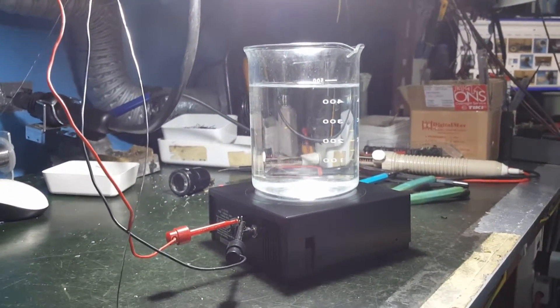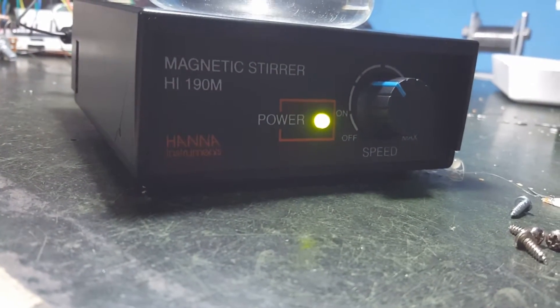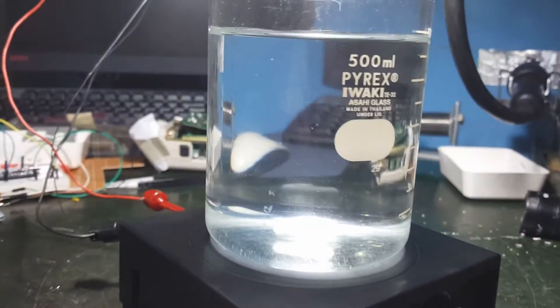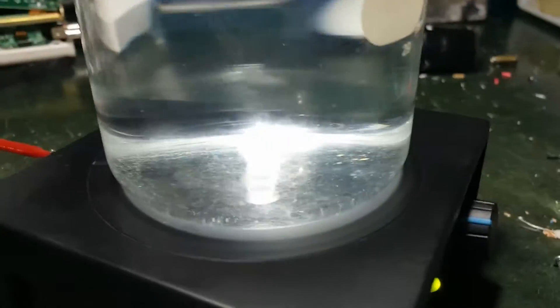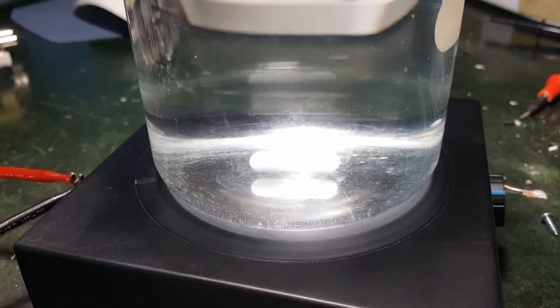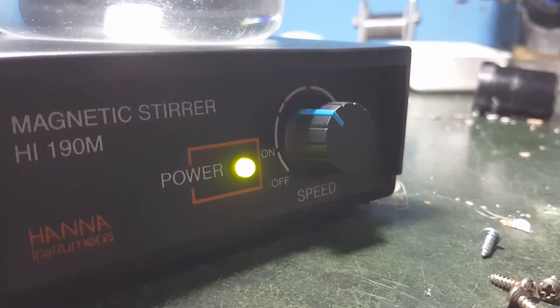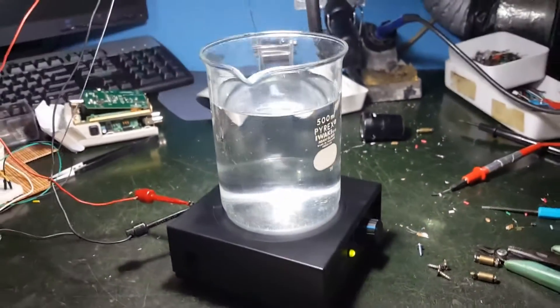It is already working as normal. The model is HI-190M magnetic stirrer. There is no water on the top, and the white stirrer bar is turning as normal. The speed is about half speed.